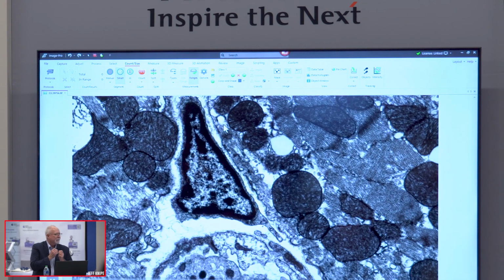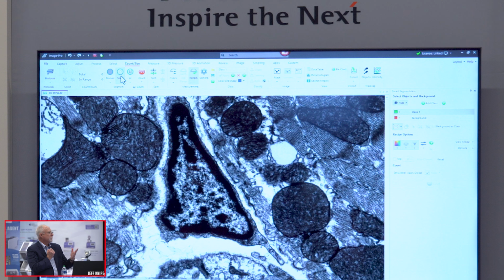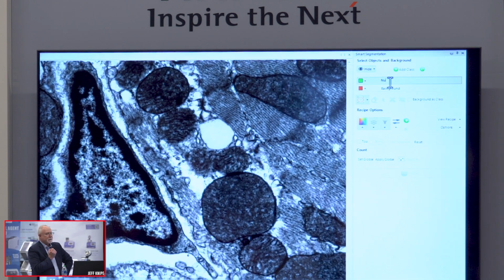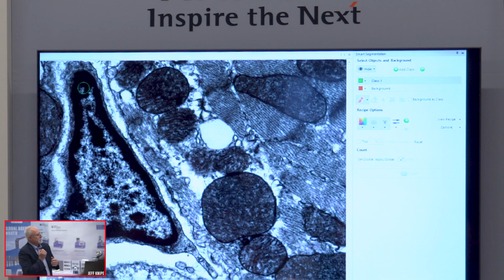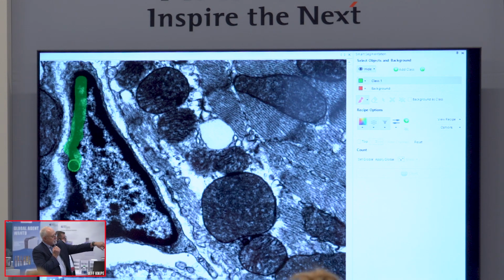Okay, there we go. So this is a TEM image, and there are two nuclei. As you can see by the shape, one's round, one's sort of triangular, depending on the morphology. And the challenge here is you have dark black areas, a lot of mid-grays that you're trying to segment. And first I'm going to show machine learning, which is a pixel classification technique. And as you can see, drawing it looks good, you can outline it.